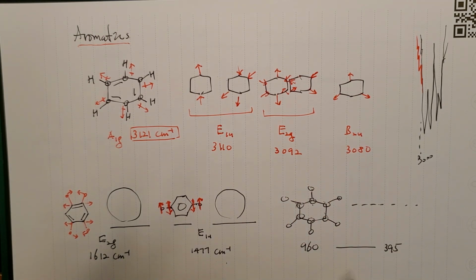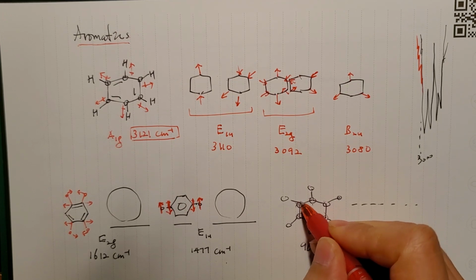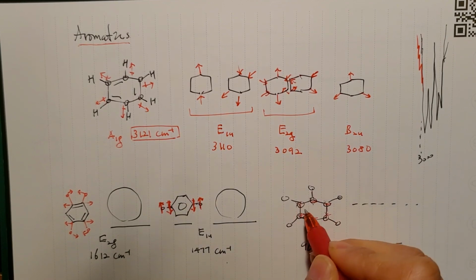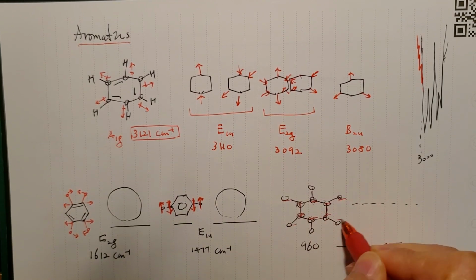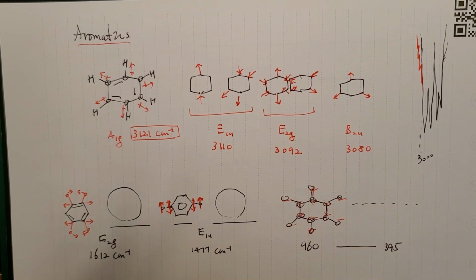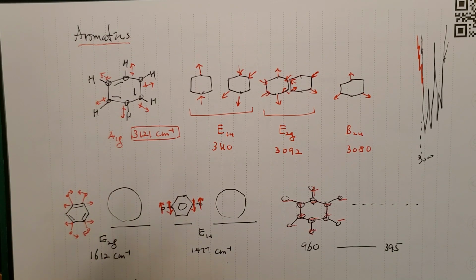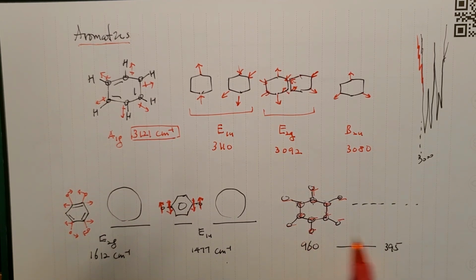So what happens is these carbons and hydrogens. There are many ways of having, such as when these carbons are going up and up, these are going down. While these are up and up, they're going down, down, down, and up, up, and different combinations. But either way, you can see that these hydrogens are scissoring kind of thing. And you saw before, scissoring of CH2 of the double bond was difficult. And these are corresponding to the out of plane motion, waggings, right? So they are much easier.